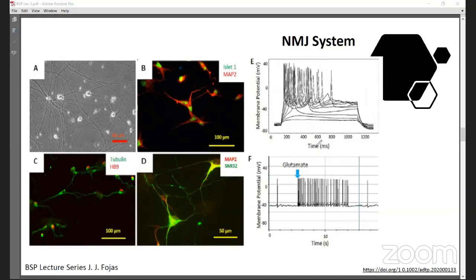This study is quite impressive, not just because I have a bias when it comes to neuroscience, neurology, and neuropsychiatry, or anything that has something to do with the brain. But this particular study is really impressive because of how they established a functional human-based ALS NMJ model. We've discussed disease modeling, so they did this by integrating ALS patient-derived iPSC motor neurons. That's impressive for me. And primary human skeletal muscle into a compartmentalized chamber.